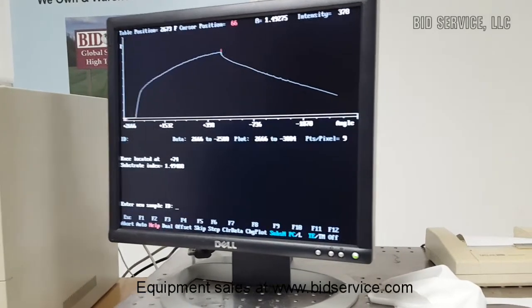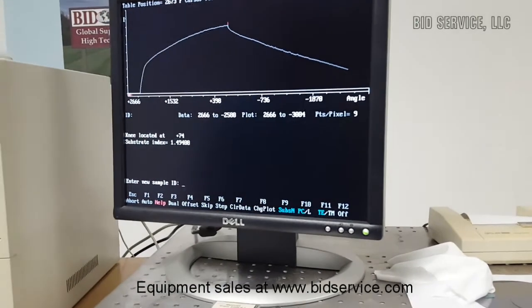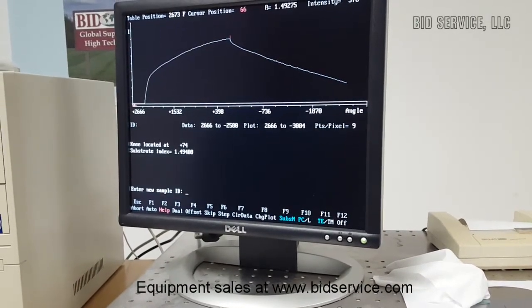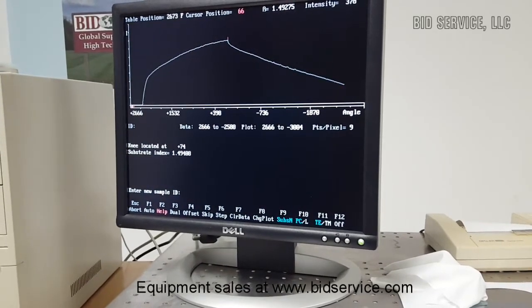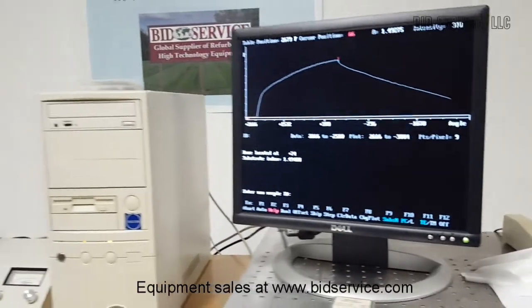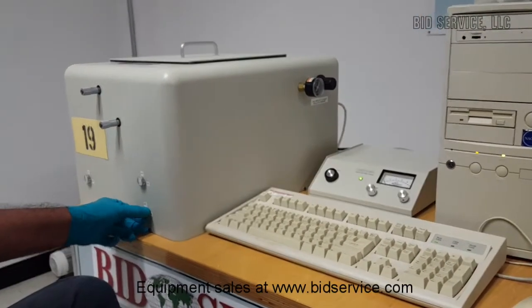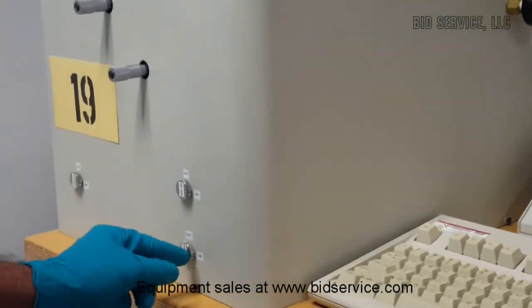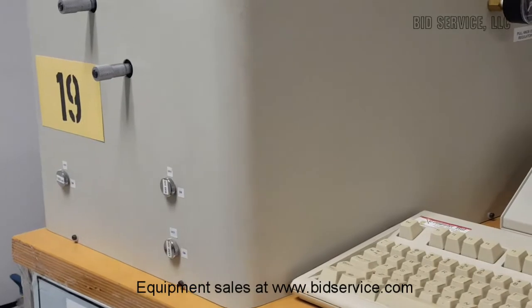And right now the printer is working. It's a slow printer, so sufficient time should be given before going for the next measurement. The printer is attached to the PC on the line printer port. So now I'm going to switch to the next wavelength and demonstrate how it goes. So I'm going to turn the knob 1550 off and 1300 nanometer on.